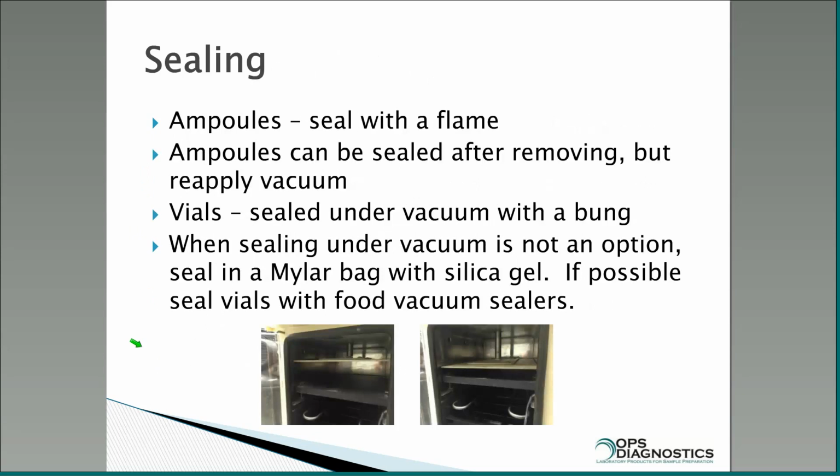All right, so sealing, you do ampules with a flame. You can remove the ampule from a manifold and seal it, but keep in mind that when you take a sample off of a freeze dryer, if it's open to the air, it will pick up water very, very quickly. There are automated ampule sealers, but if you ever look at them, they're on a little carousel, and that's not a practical way to handle something if you're going to be trying to freeze dry and keep it viable.